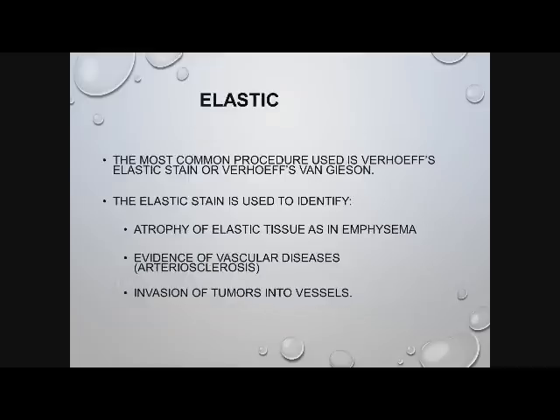Now, elastic tissue. First of all, before I go into elastic tissue, I just want to let you know that those stains that we have looked at so far all lend themselves extremely well to automating on open staining systems. So meaning if you are having issues getting certain special stains out that you have a lot to do with your H&Es, then these are stains that you can easily stretch out the volume of and stain 20, 30, 40 slides at a time and get them out faster by automating them on an open staining system.